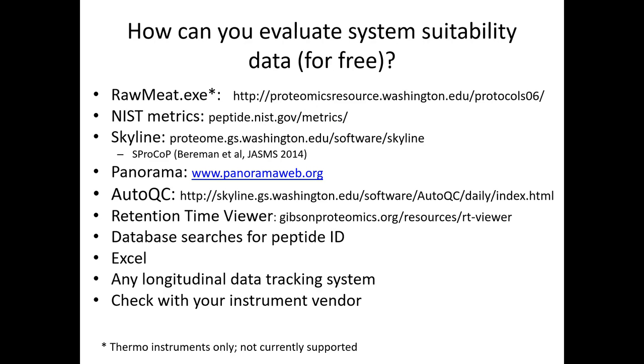So now let's just say you generated a bunch of data. How do you evaluate it? For Thermo instruments that were born before the age of the Q Exactive product line, so LTQ Orbitraps, LTQ, LCQ, there was this executable file called RawMeat, which you would bring your raw file in, and it would read all of the readbacks at every single scan. You can do this in Excalibur. You can go and see what the ion injection time was, what the measured values were, all these details are in there and retained for every single scan. This was just a nice way to pull it out.